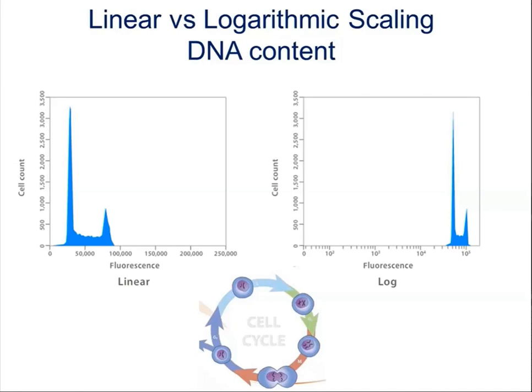So it should be x or 2x, correct? So in such a case, since the range is very narrow, you can use a DNA ploidy dye like propidium iodide or even your FxCycle Violet. These are all ploidy dyes or DNA binding dyes. These DNA binding dyes, you can see them in linear scale rather than log scale. When I'm saying that you should see it in linear scale, it doesn't mean that you should not see it in log scale. You can see, but the resolution differs.